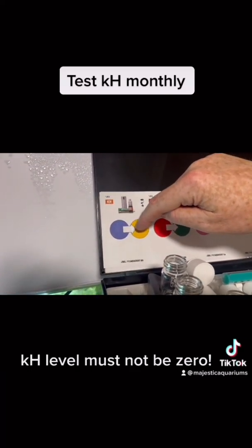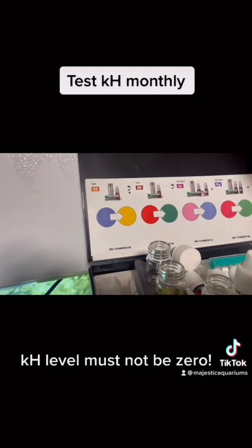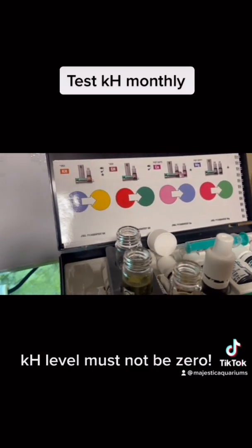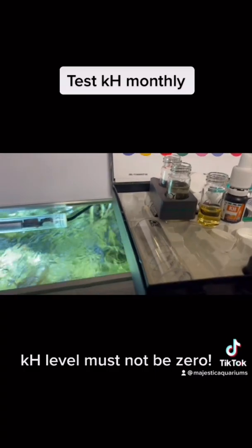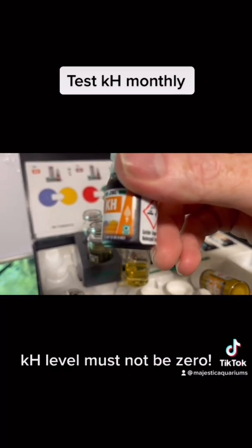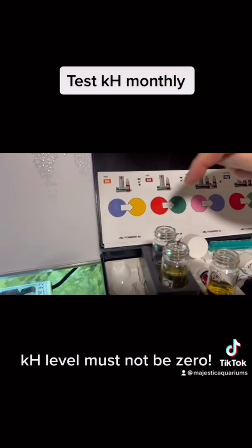If it goes yellow straight away, that means that your KH is 0, and that's bad. If your KH is 0, that will affect your good bacteria, will cause you all sorts of problems. As long as your KH is not 0, normally it's not the end of the world. But in this case, I put in 1 drop of KH. See, it says KH with a little question mark. That means I don't know how many to add. So 1, then shake, then 2, then shake, until it goes boop, like goes from blue to yellow. When you see it suddenly go yellow, then you count the drops.